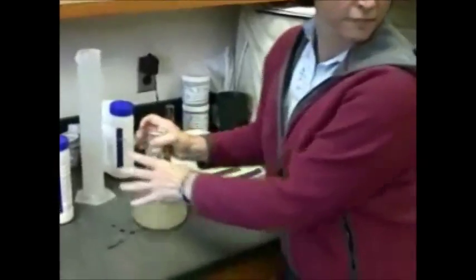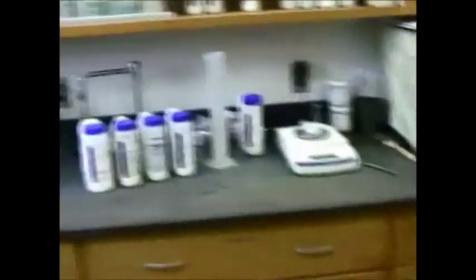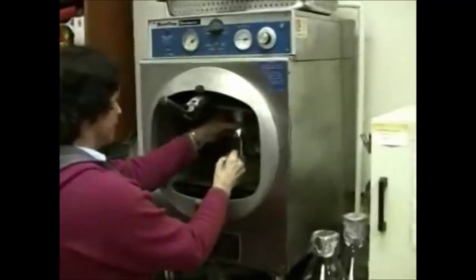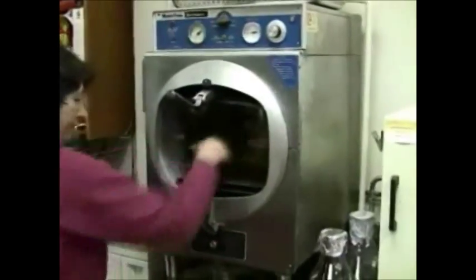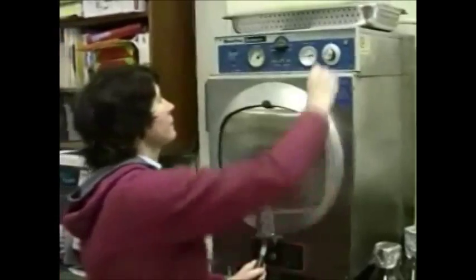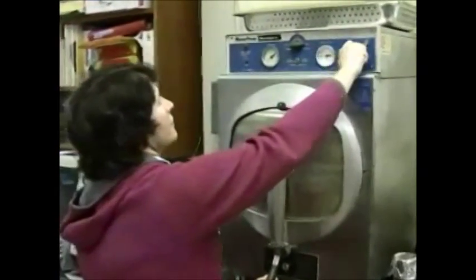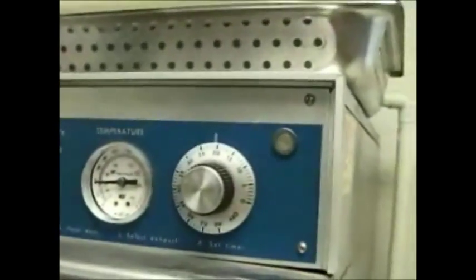Then we're going to walk over here to the autoclave. There's the autoclave — it's a small volume autoclave. It runs off electricity and heats up the reservoir of water. We're setting the time; let's look at the dial and see if we can focus in on that.